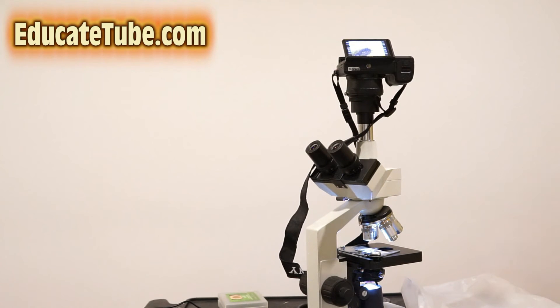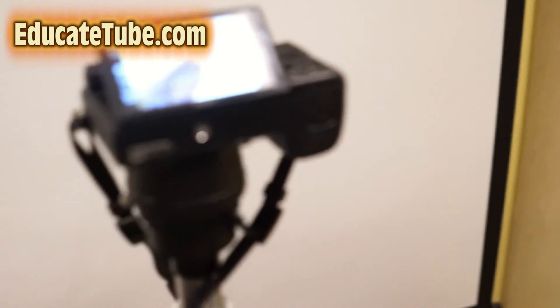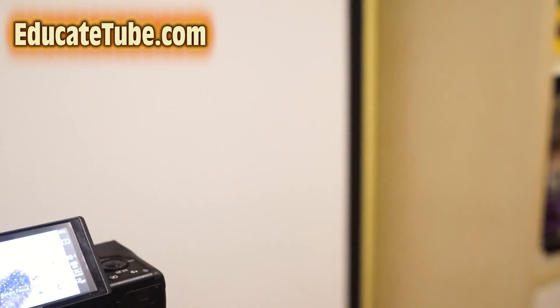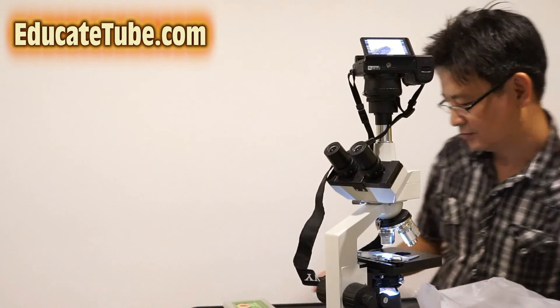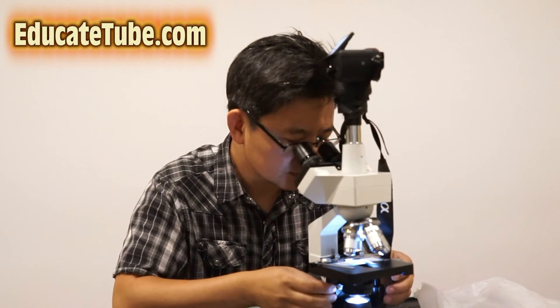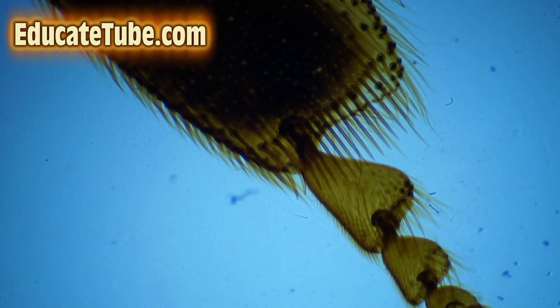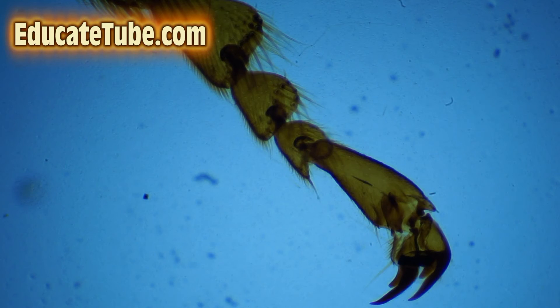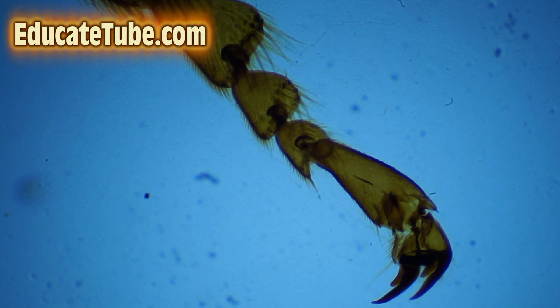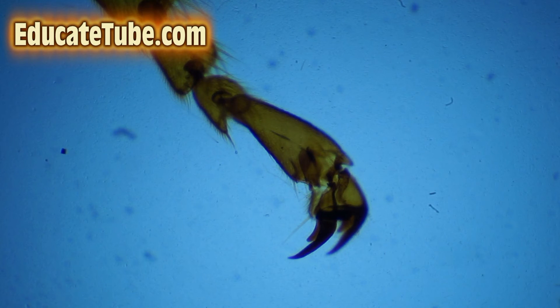Let's bring it in closer. As you can see here, we have a hind leg of a Honey Bee, starting with the Basitarsus — the large structure there. As we move down, there is the four-segmented Tarsus, including its claw. Quite beautiful, isn't it? A 1080p view at twelve times zoom. Beautiful structure — you can see the claw, the four claws.